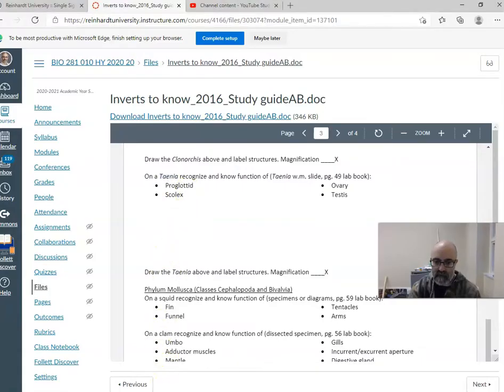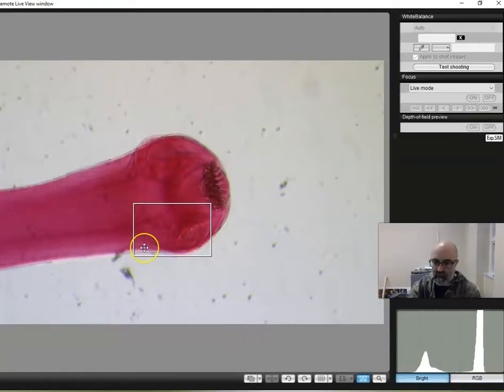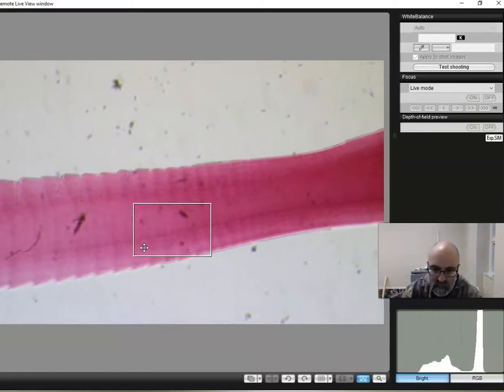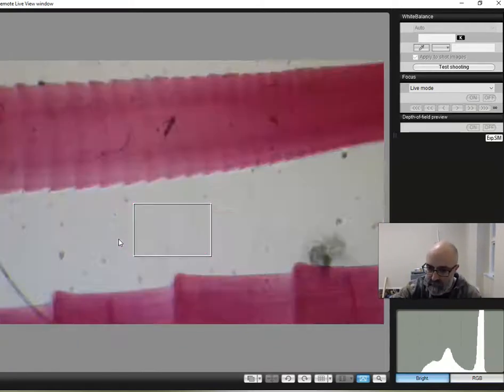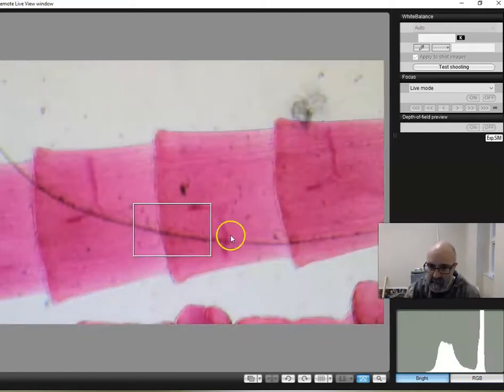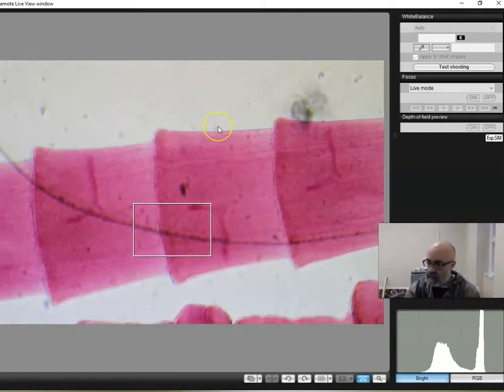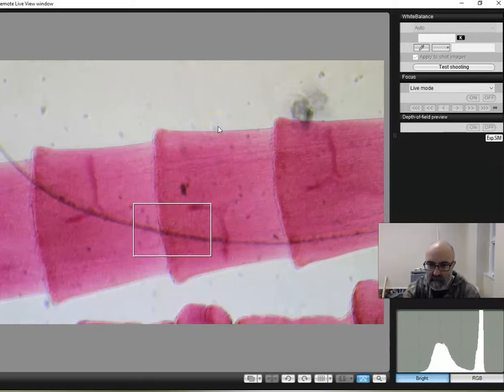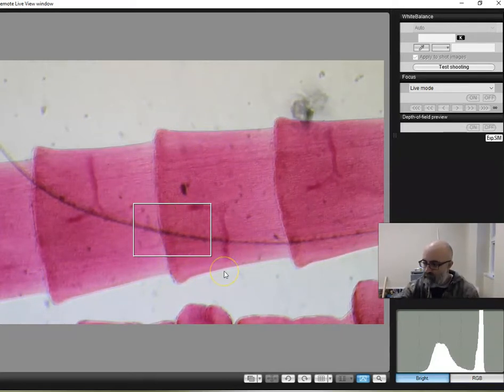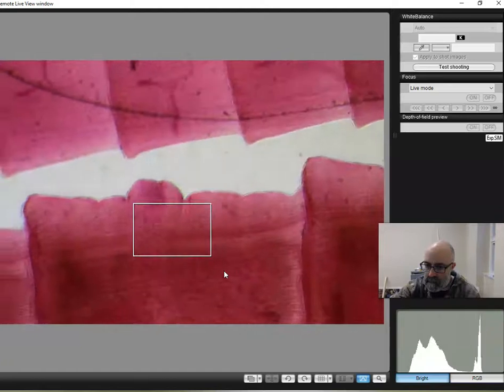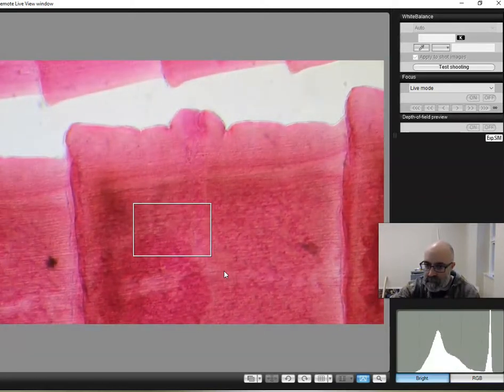A proglottid. Where do you find a proglottid? Well, all of these individual little rectangles here are proglottids. Big ones. This is a proglottid. That's a proglottid. They're all proglottids. So a proglottid is the individual segments of a tapeworm.